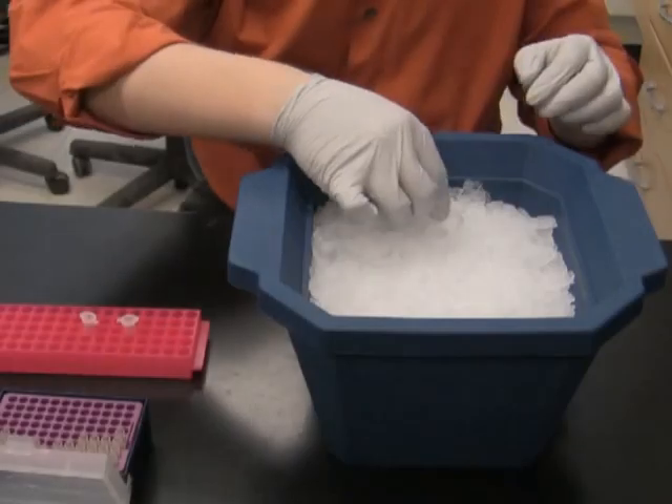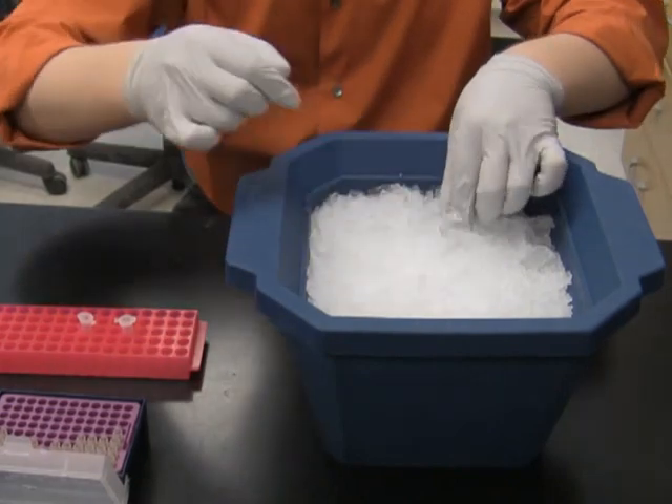After incubating them for 15 minutes on ice, I label the tubes as 'vector plus insert' and 'vector control', and I add the corresponding ligation reaction to each of the tubes.